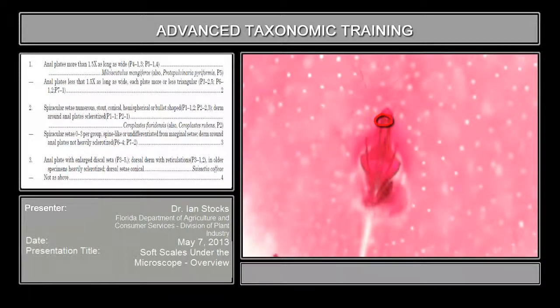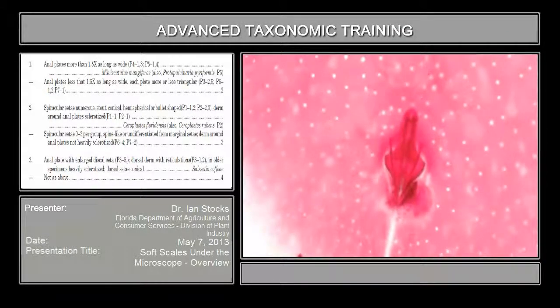You can also see the anal tube here. There's the opening for the anal tube. All of this in here is the membrane that surrounds it, and these sclerotized regions in here are the anal tube setae, or the anal ring setae. This structure is an eversible tube. It can be pushed out of the interior of the body under pressure. The ring at the end of it has setae on it, and the idea is that the droplet of honeydew is pushed out along that tube, gets to the end, and is held in place by those anal ring setae. Then when the muscles contract down on it fairly rapidly, those setae close up, and it ejects that honeydew droplet away from the body. So it's not just a shape or a piece of morphology, it's a piece of functional morphology helping them to eliminate the honeydew.